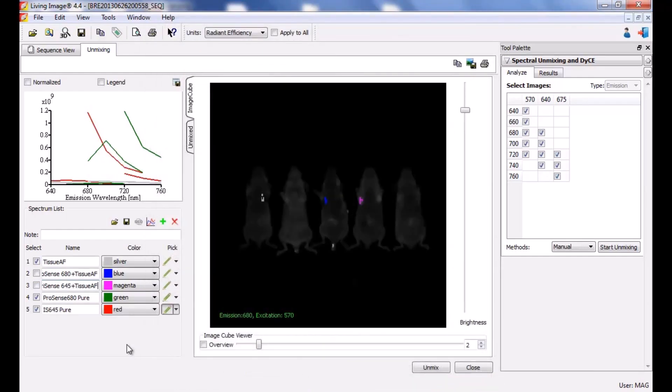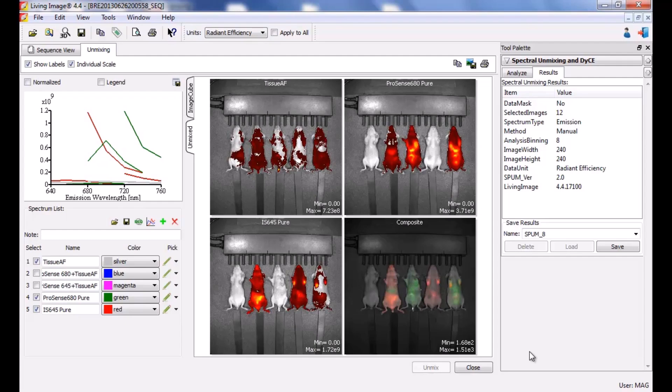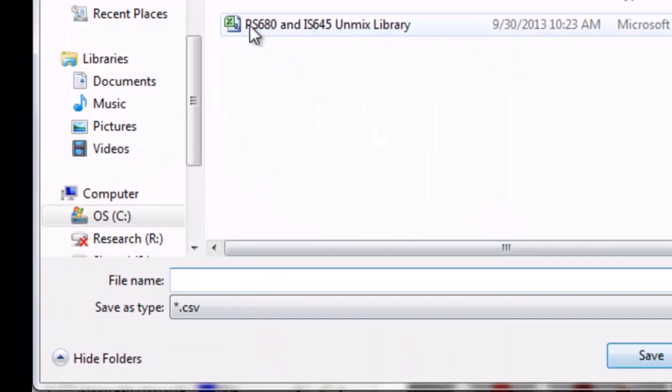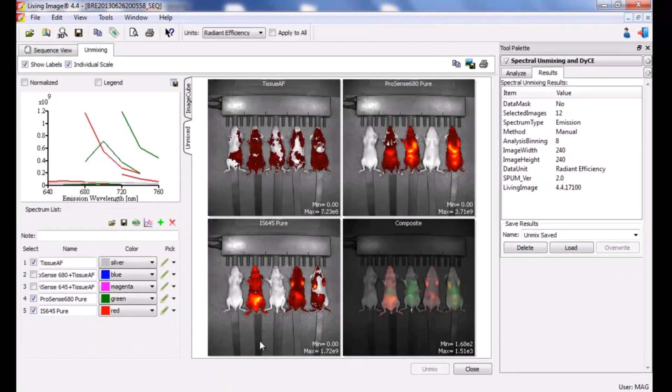After closing the window, the new pure components are now visible in the spectrum list. The software deselects the mix component and automatically selects the pure component. Click unmix. Our unmixing results appear automatically. Save your unmixing results. After the images are saved and you visually determine the unmixing was successful, save the library by clicking the floppy disk icon, add an appropriate name, and click save. The library you just saved can be used for any imaging experiment that uses the same mouse strain, probes, and filter selections.